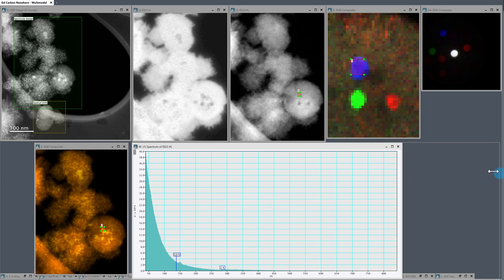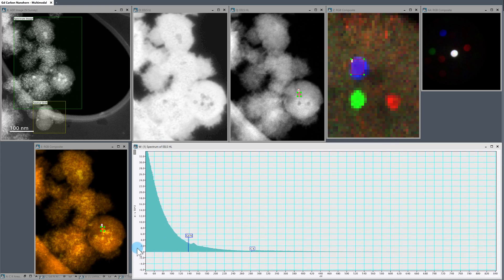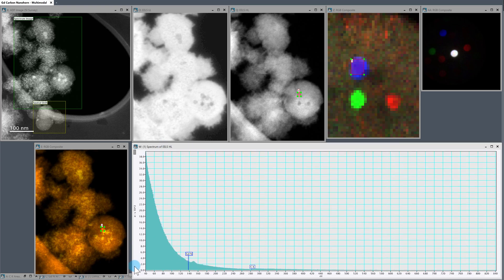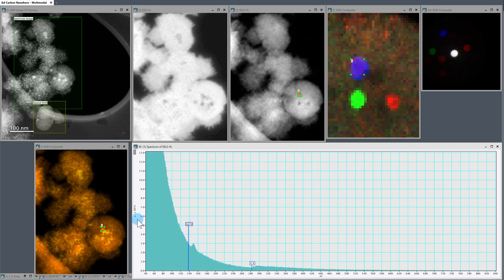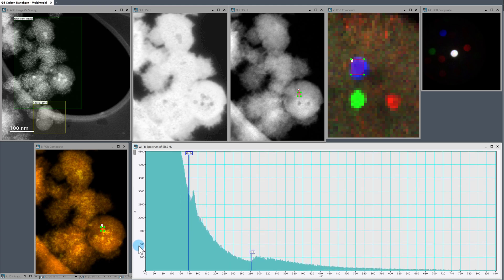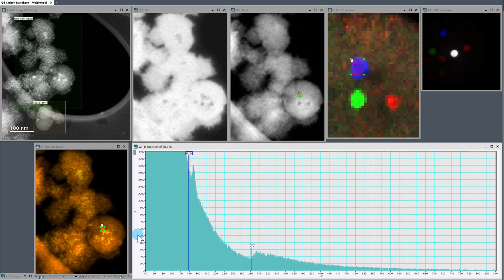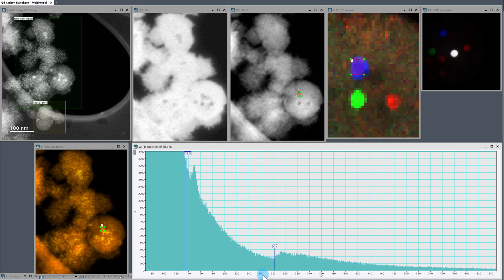And yeah, zoom in. Okay, so that's the sum of all of these pixels. We can see the N edge, we can see the carbon K edge.